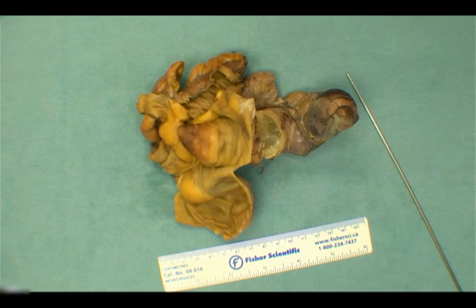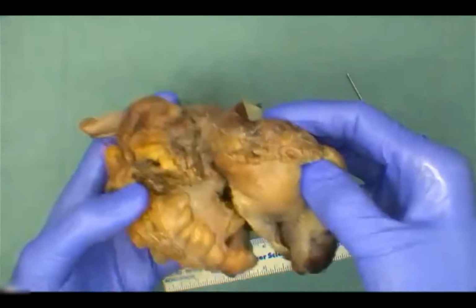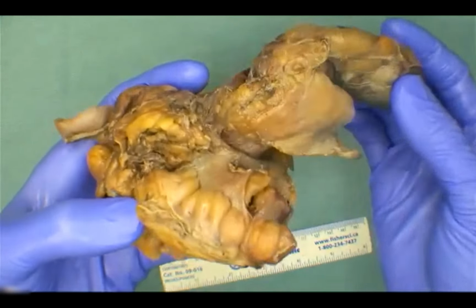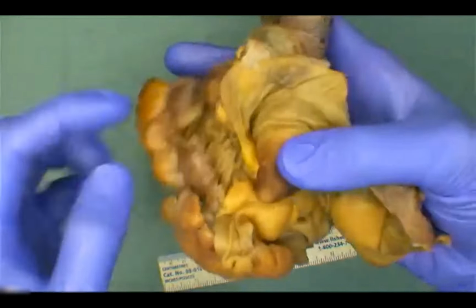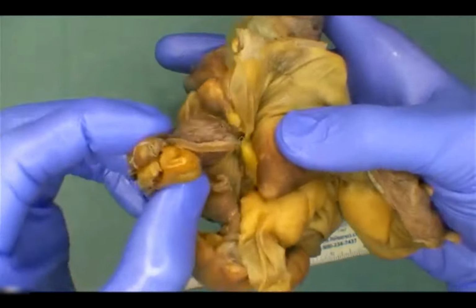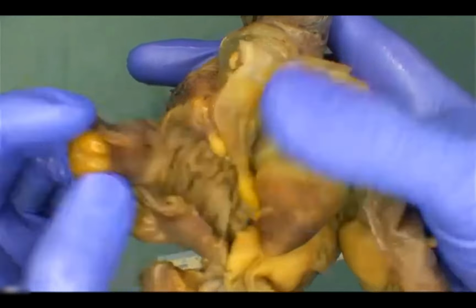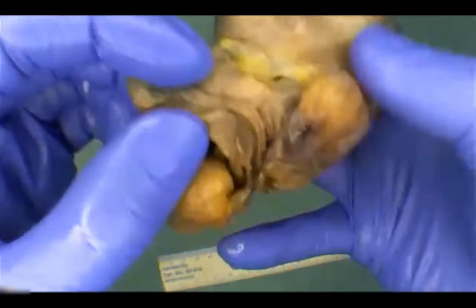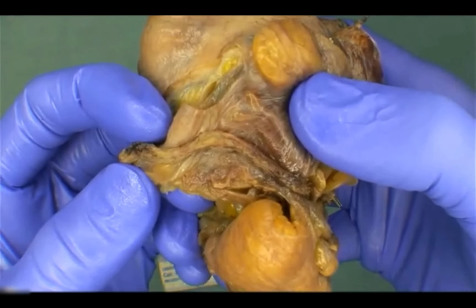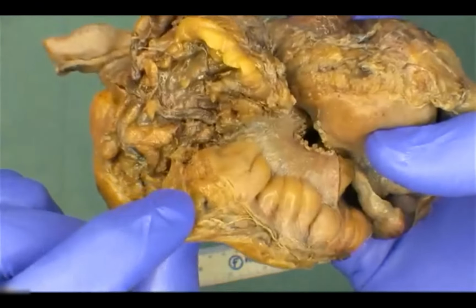How many margins do you think are on the specimen or are important perhaps? Yeah, okay, so we've got a nice little spread, and I think if we go through our specimen, and recall that a margin is where a surgeon has had to cut in order to resect the specimen, we'll start proximally. We've got a segment of our terminal ileum, and the surgeons had to cut across the ileum to resect that, so we've got one here. As we move across and into the colon, into the cecum, surgeons also had to cut to resect that. So we've got another nice staple line here. That'll be 2. And then you'd have to cut across the small bowel mesentery, so that would be 3.